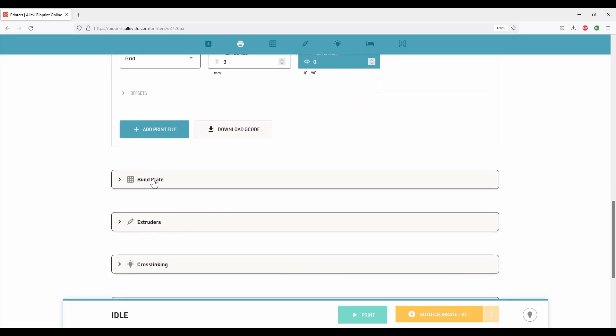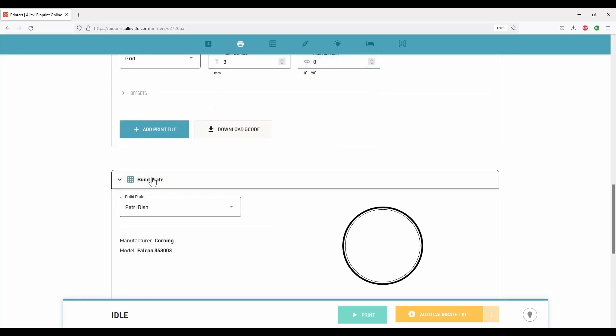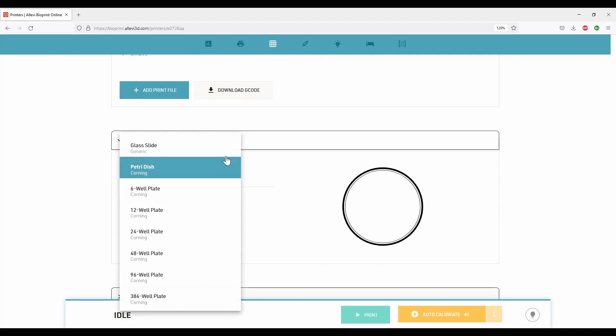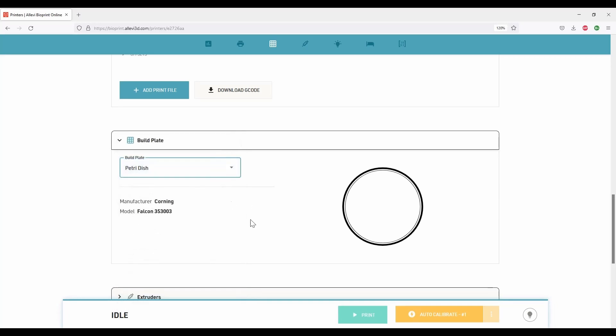Next is the build plate. We can choose from a glass slide to 384 well plate. Here, I'll choose a petri dish. It doesn't matter if you are not using the same manufacturer as shown here.